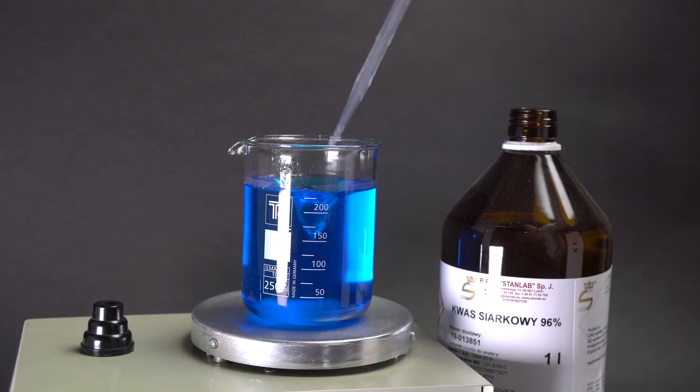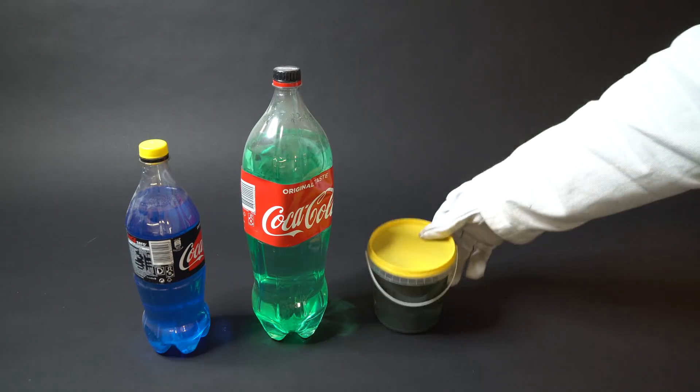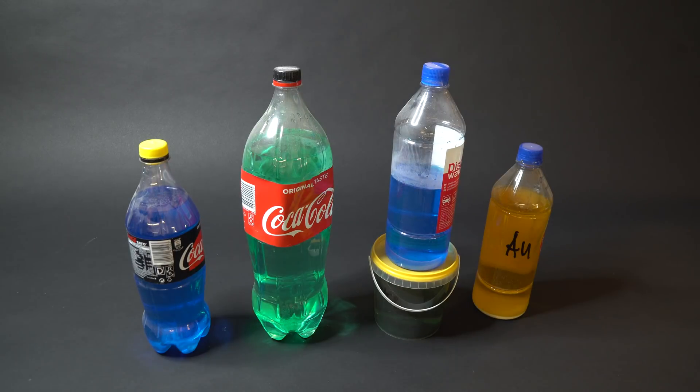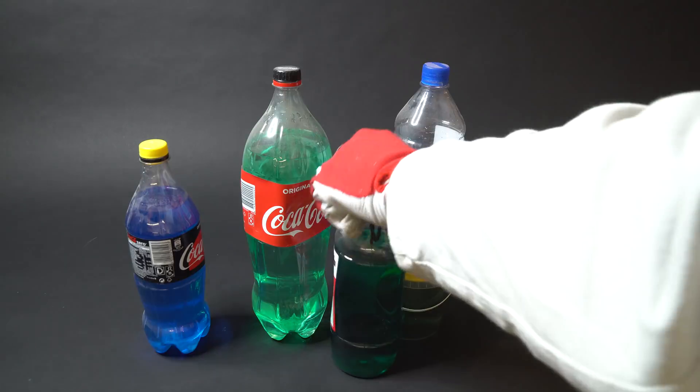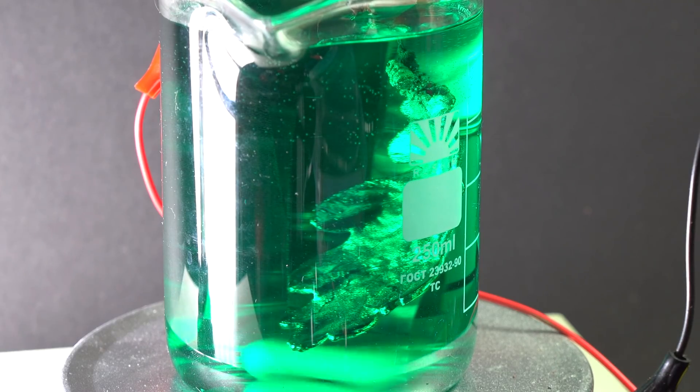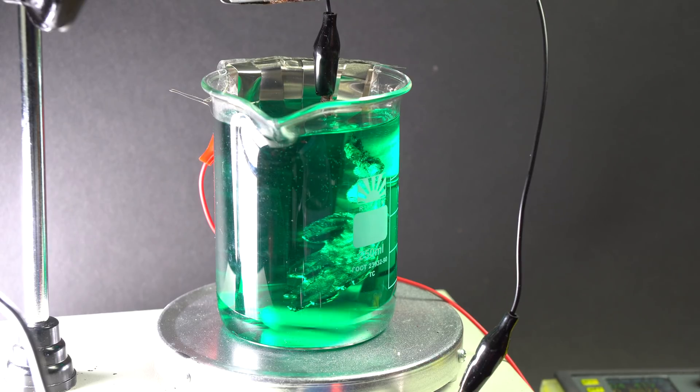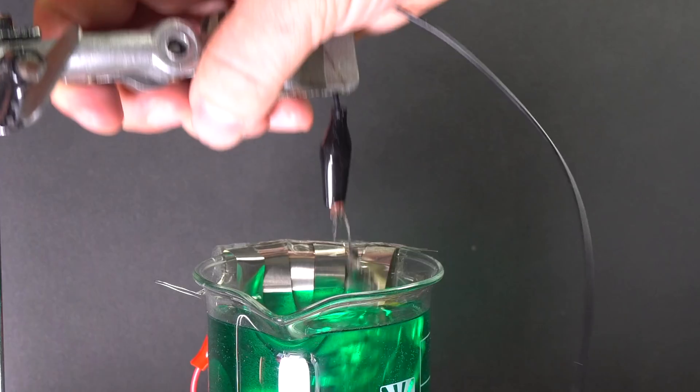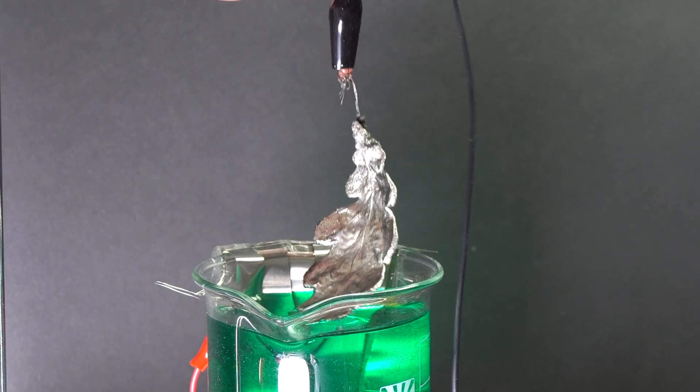Hello everyone. During the last year I have run lots of galvanic metal plating experiments and I have accumulated a lot of used electrolytes which have turned into chemical waste. For various reasons they no longer work, which is why I have to either dispose of them as scrap or recycle them myself.